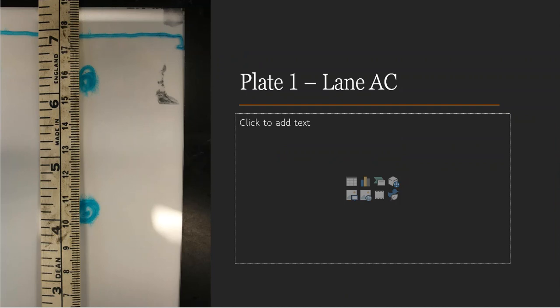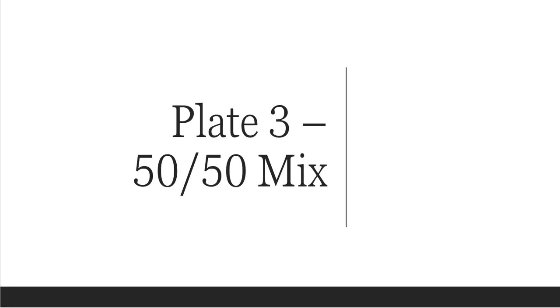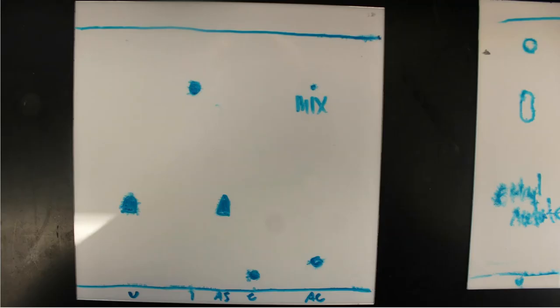Finally, plate one, lane AC. And lane AC really stood for Tylenol. And it also showed up in two spots. And I think both of those show up pretty well on your screen, so you can make measurements as you see fit. All right, so finally for plate three, which is my 50-50 mix. For plate three, this is what I saw.